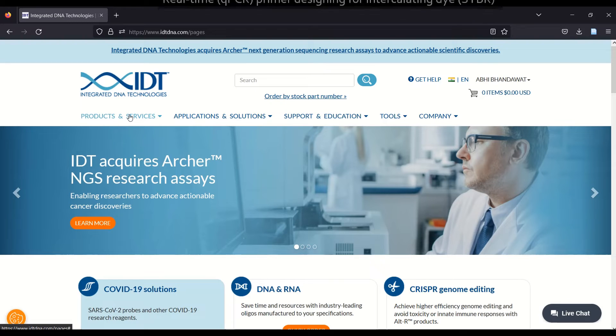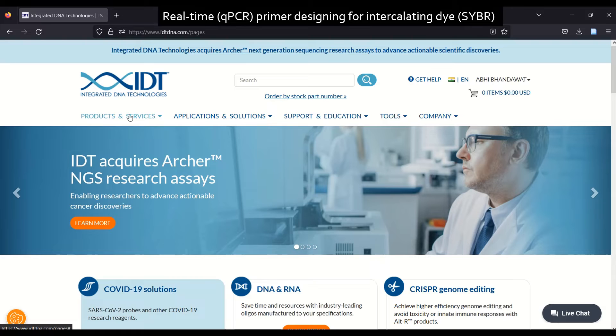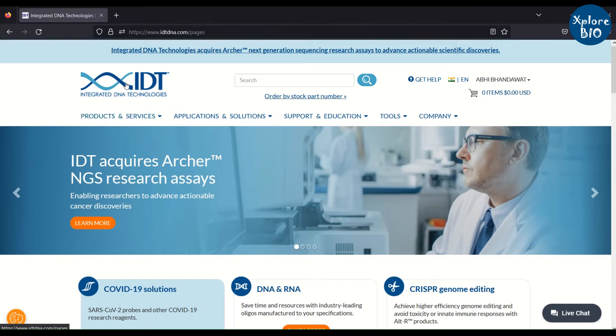For designing real-time primers, just go to the Integrated DNA Technologies website. Under Tools, look for the PrimerQuest Tool.